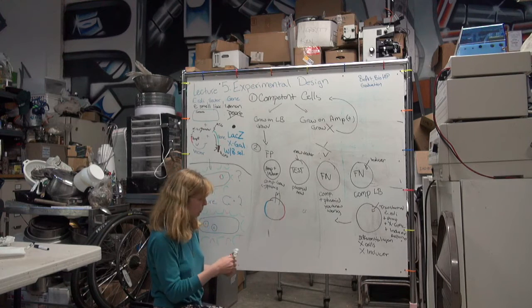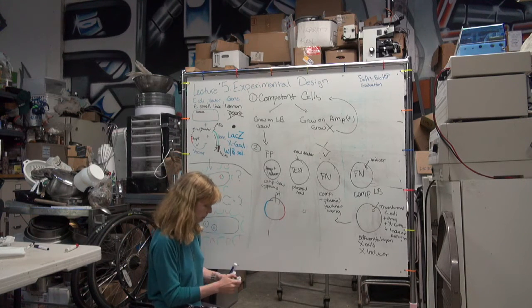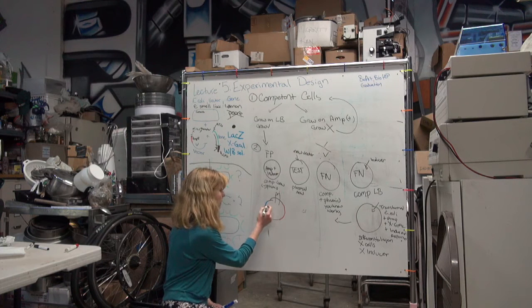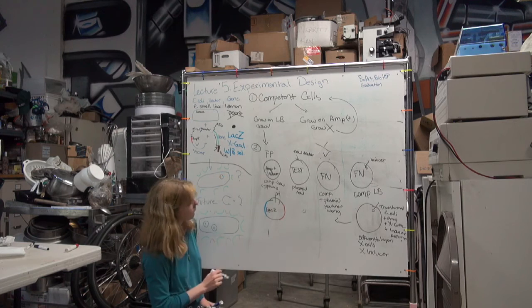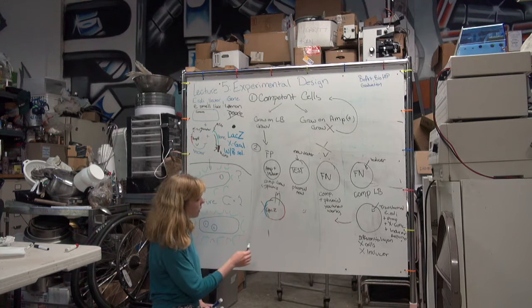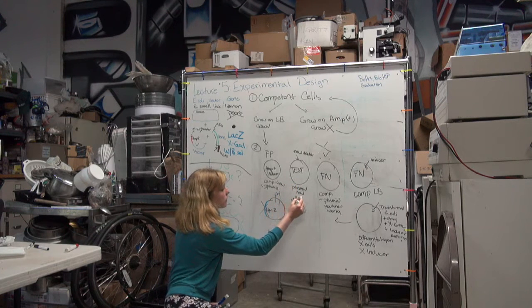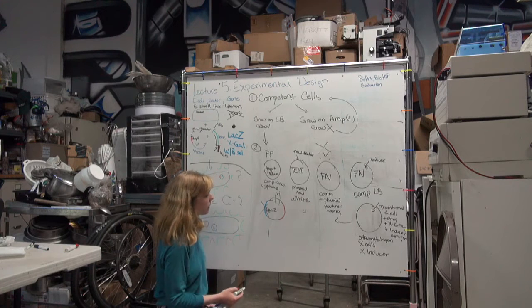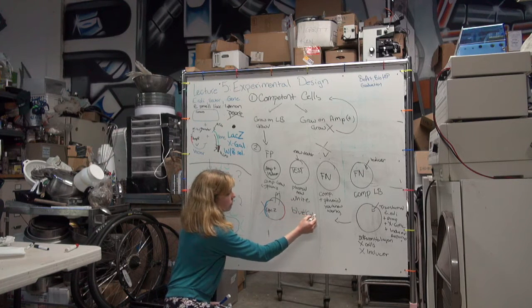The plasmid that we're changing, that we don't want, has the ability to make blueness in our plates. That's why it's blue. Go figure. Okay. So we're going to be interrupting that gene and putting in our own gene. So the colonies that we want are going to be white, right? And blue colonies we don't want.